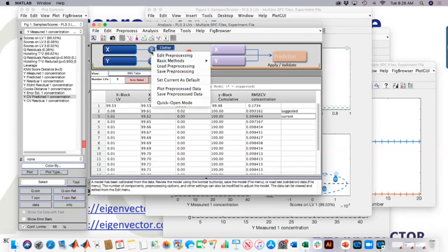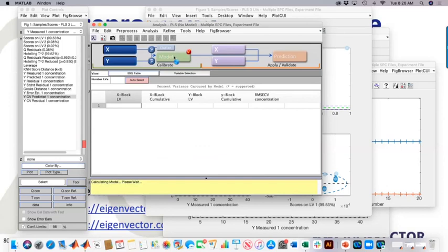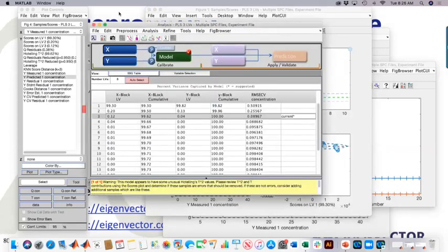I'm going to just go back to mean centering, then reset it, make the model, and go on with the presentation. Yeah, we had a couple of questions, and I think it's sort of like, how do you find that balance where you're adjusting your pre-processing, you're trying to figure out did I improve things, did I overfit, like what's the general guidelines about those little iterations as we're building up a model?